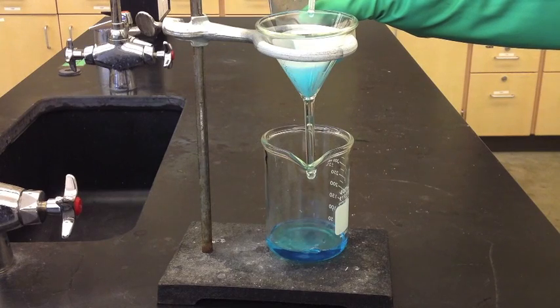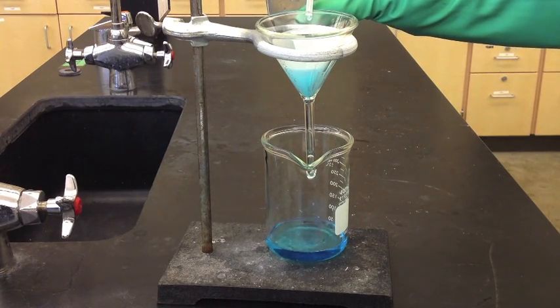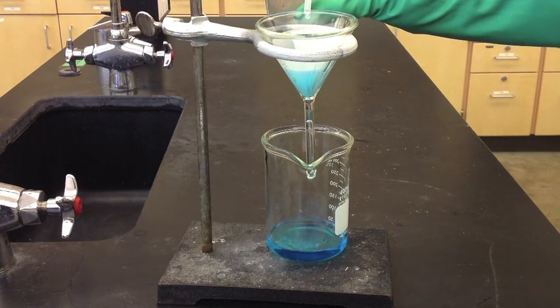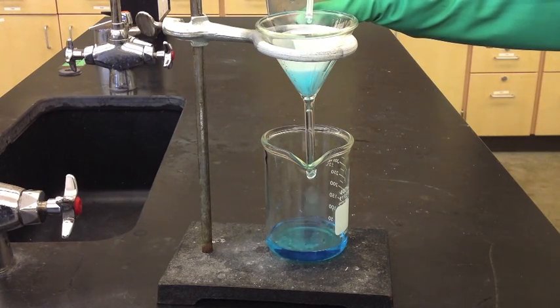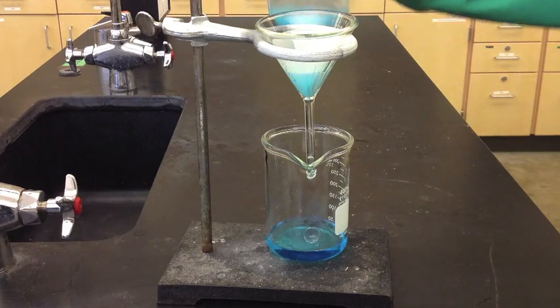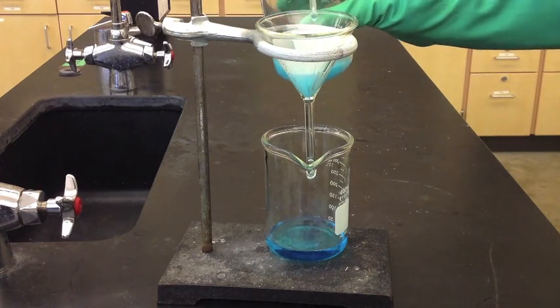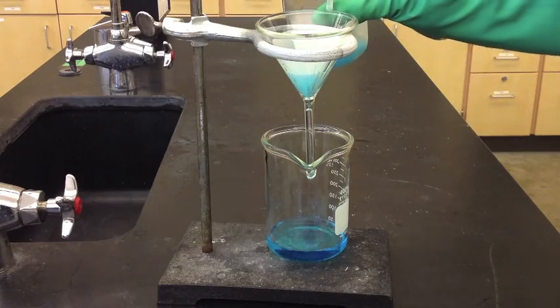Now we're getting down to the actual solid particulates, and you can see it's slowing down considerably. It's really important not to overtop the filter, because the filter paper is there for a reason. If the filter paper is not properly attached, the material will slip by and end up at the bottom, and you'll have to repeat filtering it through several times.